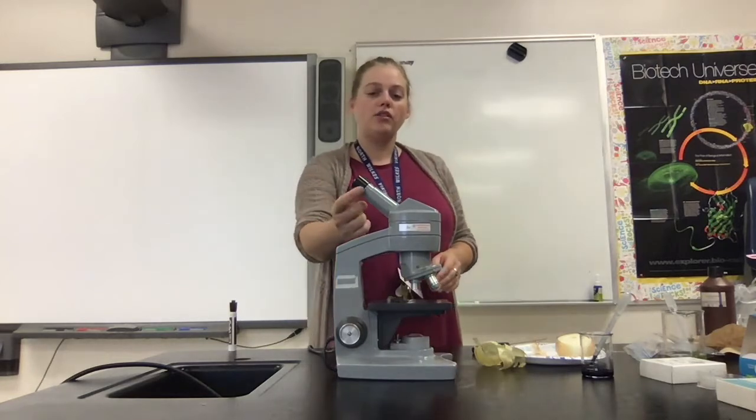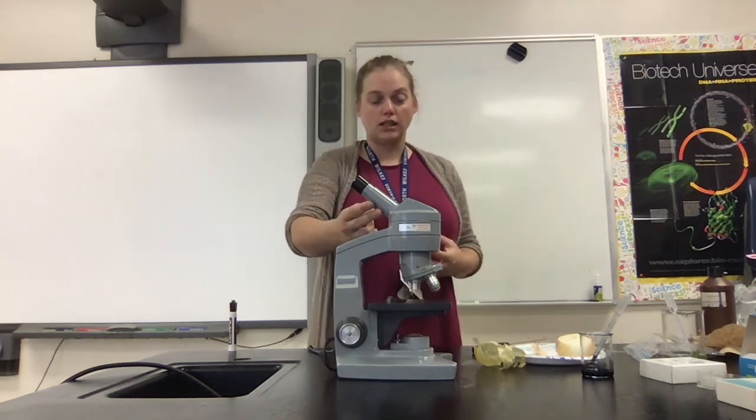Microscopes have a piece here called the eyepiece, and eyepieces have lenses in them. And the lens is going to magnify something to be bigger than it normally is. So all of the microscopes that we have in this school have an eyepiece with a lens that can magnify something to be 10 times larger than it normally is.